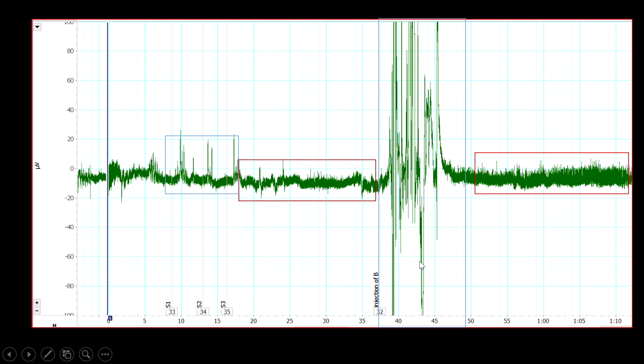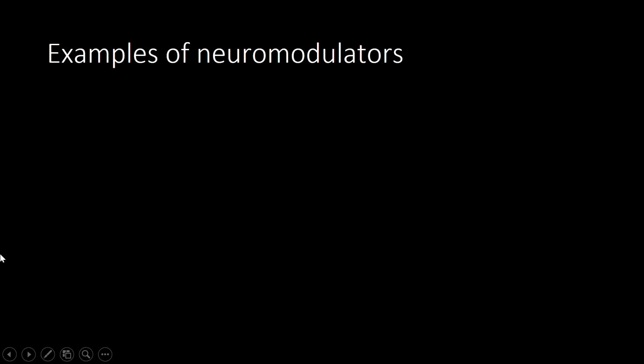And then same here, the lines here are crazy. It's because I injected the solution into the cricket. So there's a lot of stimulus happening. That's why they get a lot of neuron firing. You see the amplitude change a lot because more neurons get fired during this short period of time. And then after I take my needle out and stop my injection, they come down, and then they go back to spontaneous firing.